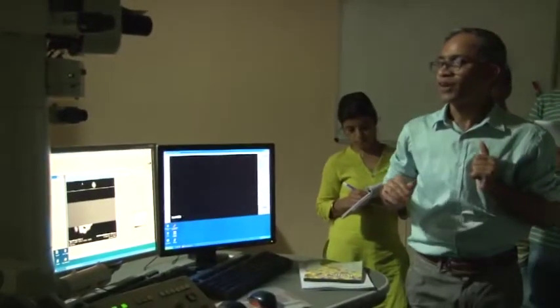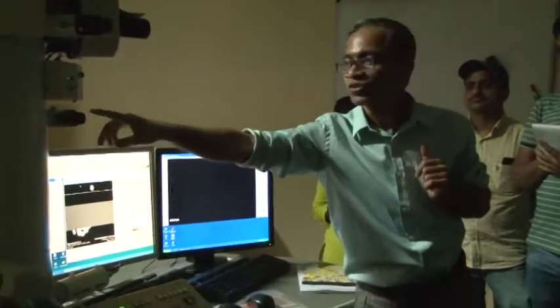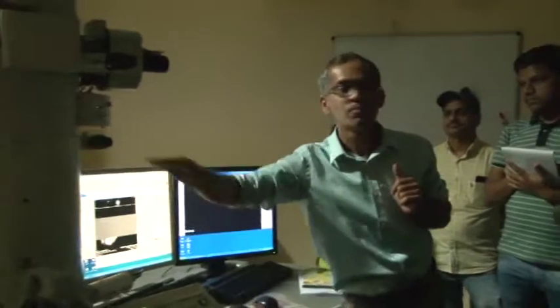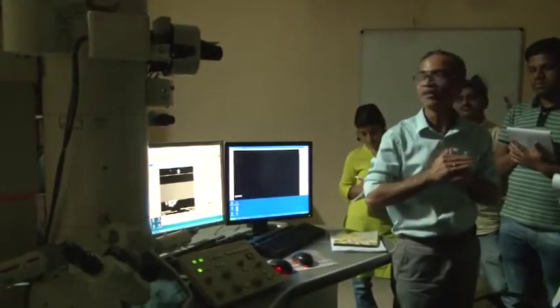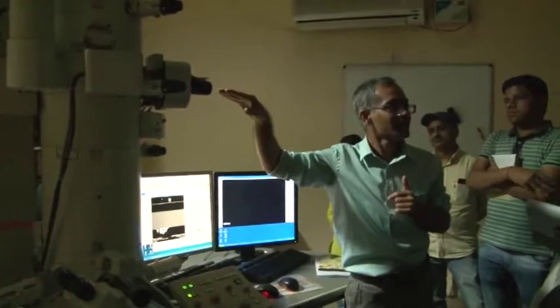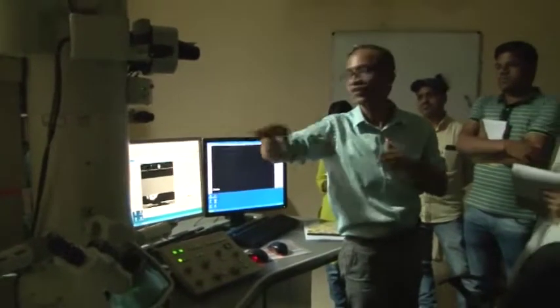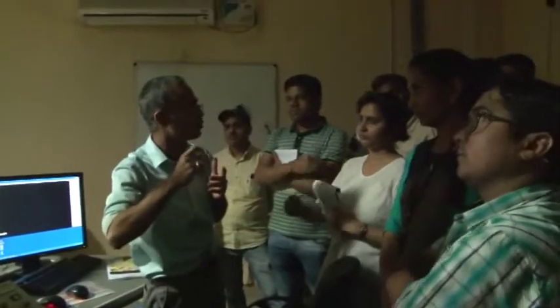Okay. So after that, this is the selected area aperture. This selected area aperture is in a plane which is called the first intermediate image plane. Okay, and this plane is equivalent to that of our sample. Sample plane is equivalent to an image plane because they are optically equivalent, or optically conjugate.